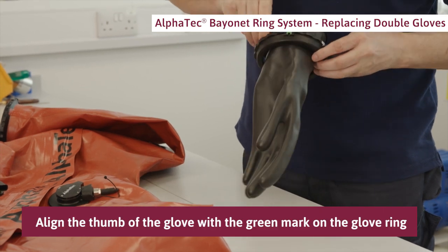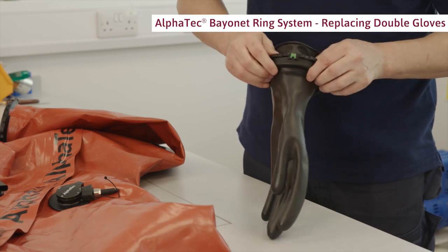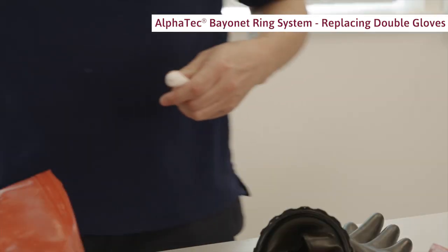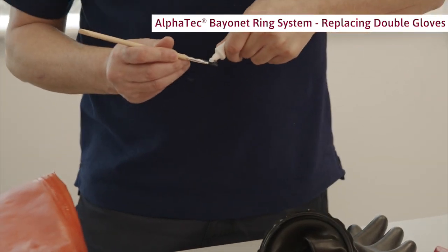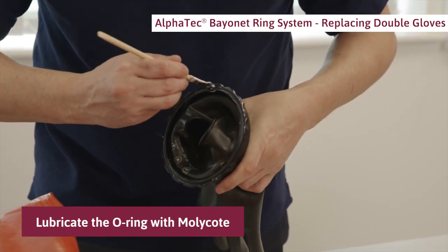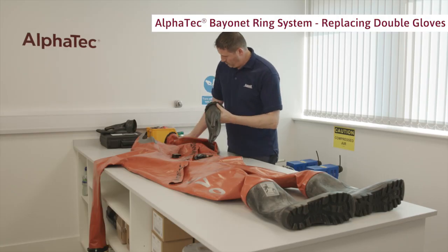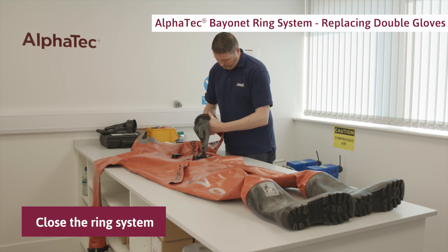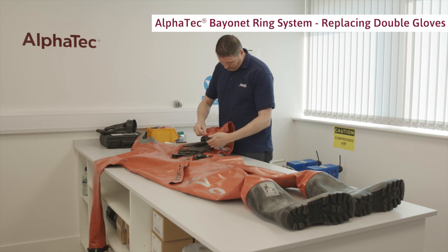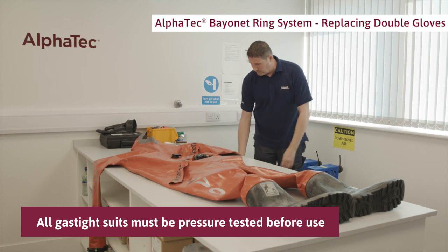Make sure the ring of the inner glove is approximately five centimeters or two inches into the rubber glove. Push the glove and ring set through the glove ring and align the thumb of the glove with the green mark on the glove ring. Push it firmly into place using your thumbs. Fold the glove shaft into the glove ring. Lubricate the O-ring with Moly Coat using a brush or your finger. Position the white marks on the sleeve ring and the glove ring together and close the ring system. Attach the safety locking pin. All gas-tight suits must be pressure tested before use.